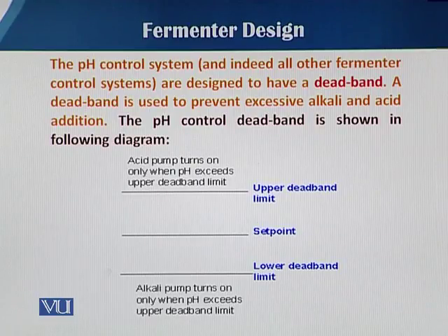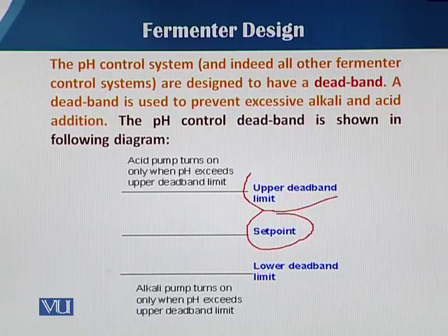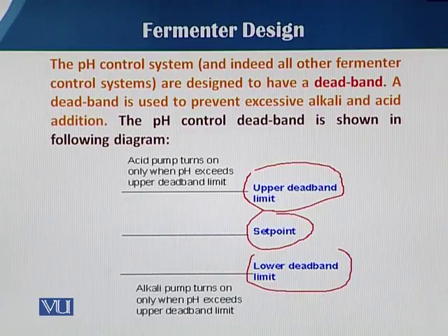So there is a continuous on and off of the alkali and acid delivery systems. In such a case, the continuous on and off can affect the fermentation volume. One is the set point, which is the pH we require, and then the upper limit, known as the upper band, and then the lower limit.